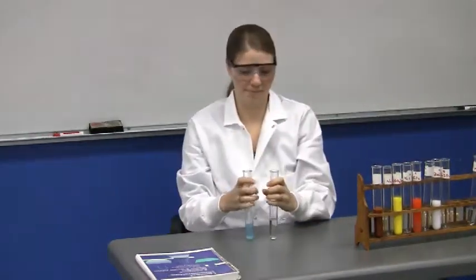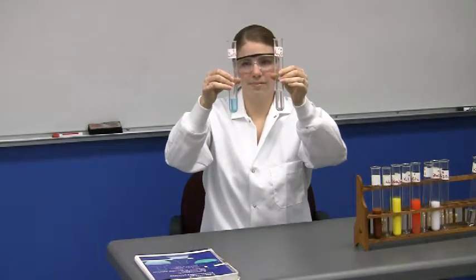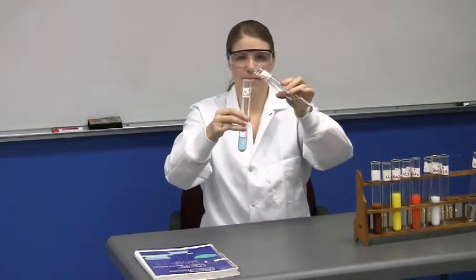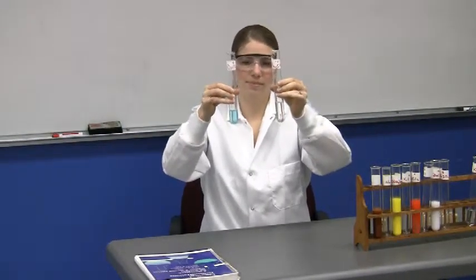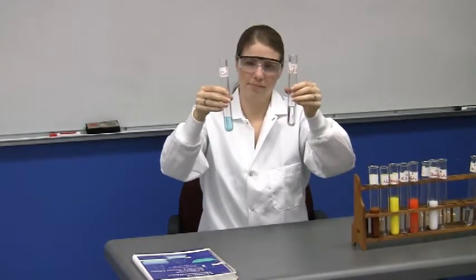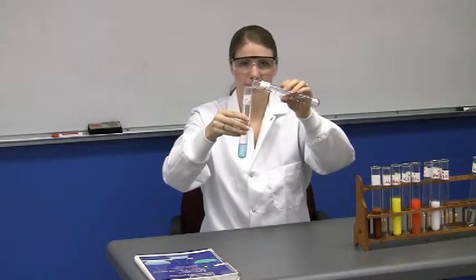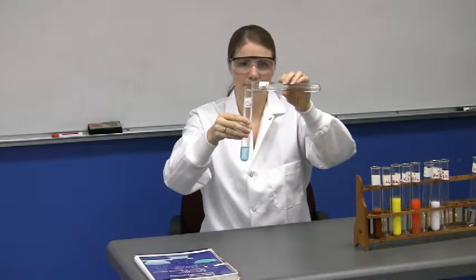The next pair of compounds is CuCl2 and Na2CO3. Na2CO3 was also in the first batch of test tubes, so it reappears. Notice that this is the first and only test tube that has a blue color. So you will know, if you don't already know, why that test tube is blue. And once again, it's CuCl2 plus Na2CO3. Go ahead.